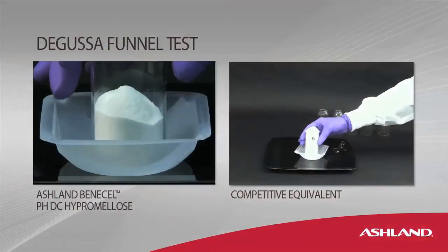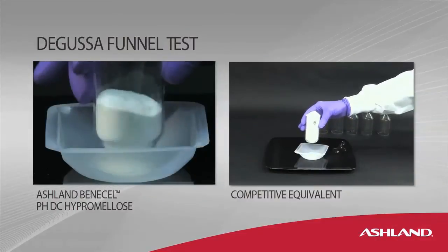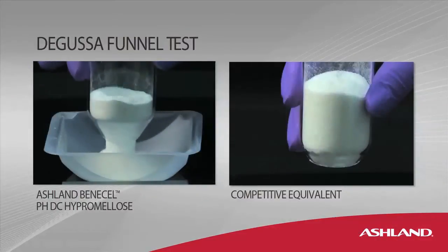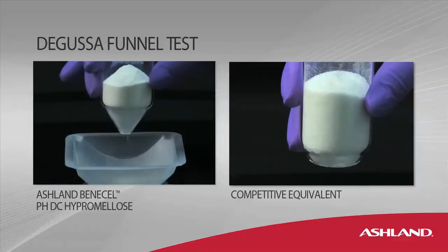This test clearly demonstrates the enhanced flow properties of directly compressible grades of Benicel Hypermelos when compared with the competitive equivalent product.